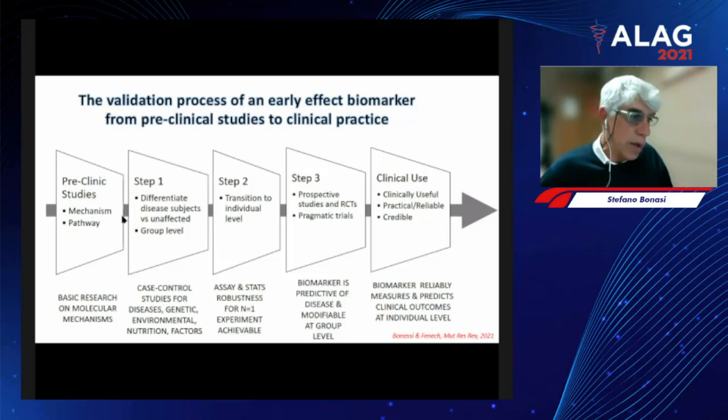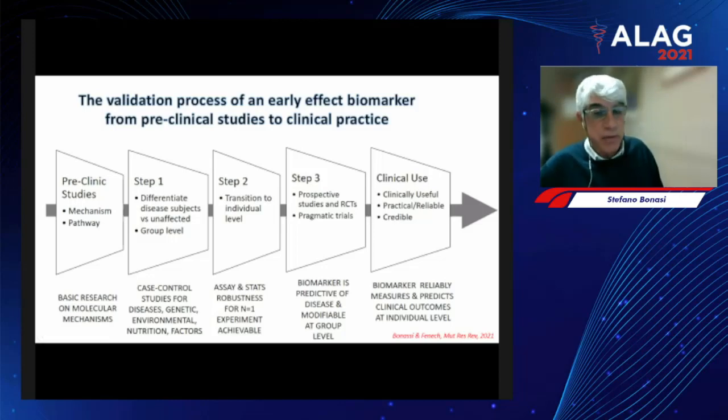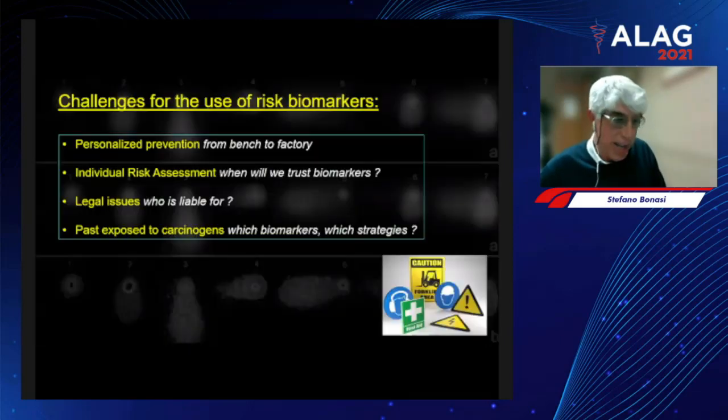Now we really need to validate further, with other cohort studies, the link between DNA damage in healthy people and mortality, survival and cancer, and be ready to start a controlled trial, the real proof that things work. If we can, for instance, reverse DNA damage, do we improve survival? This is the next challenge.